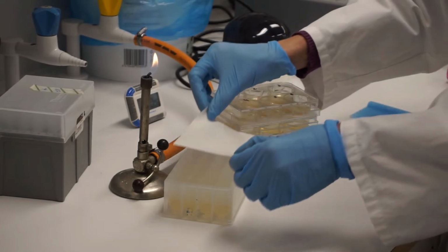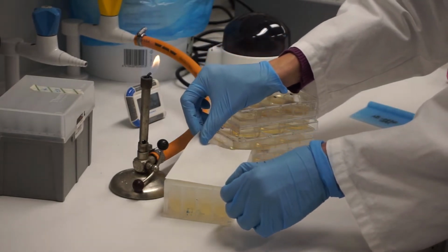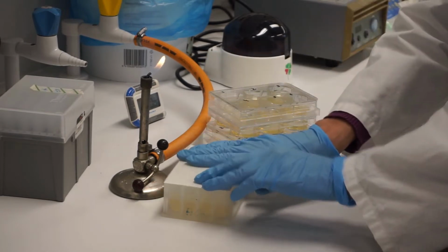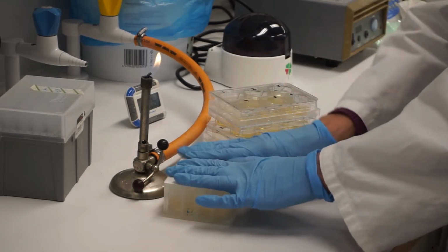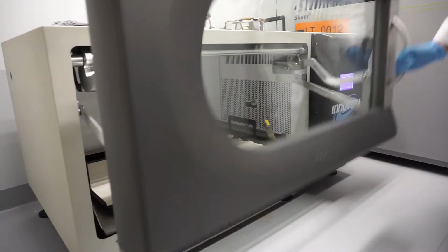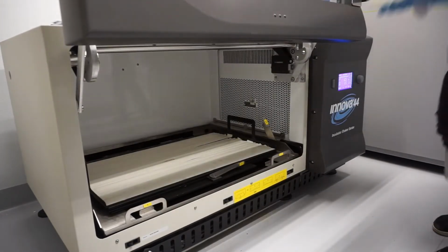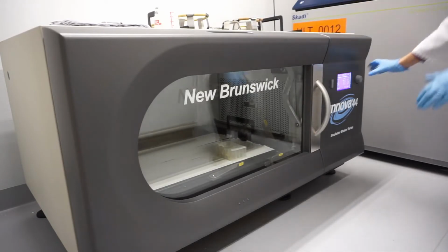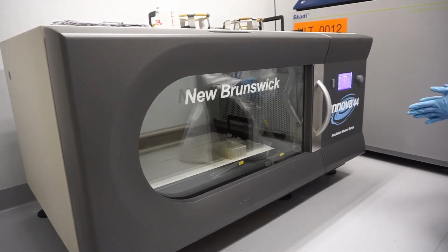Seal with a breathable sealing film. Incubate at 37 degrees Celsius overnight. This is the pre-culture for the expression screening.